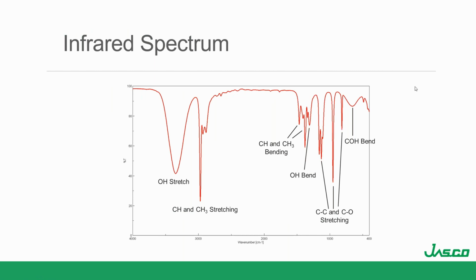So this is an isopropanol spectrum showing the different bends and modes that are possible in this molecule. The OH stretch occurs here at 3200, and the CH stretches occur around 3000. And there's CH bending, OH bends, stretches, and bends, more bends. So each molecule is going to have its own set of peaks based on all these possible vibrational modes.